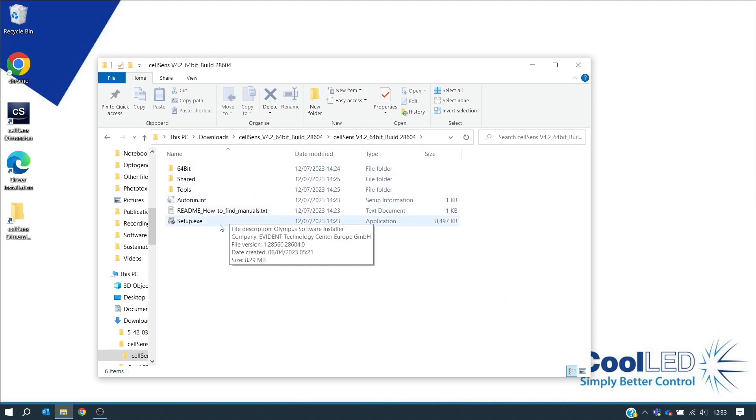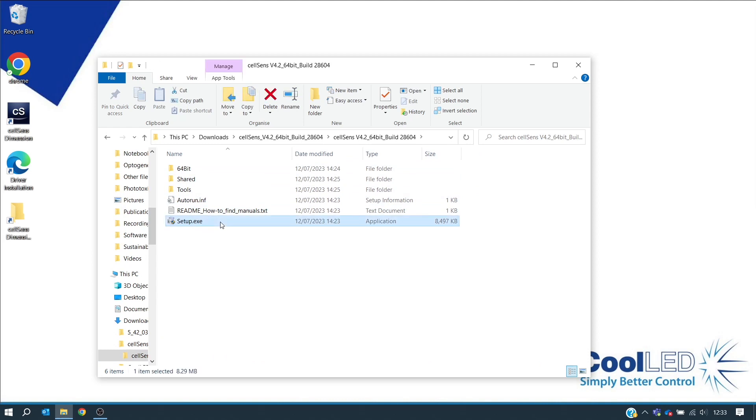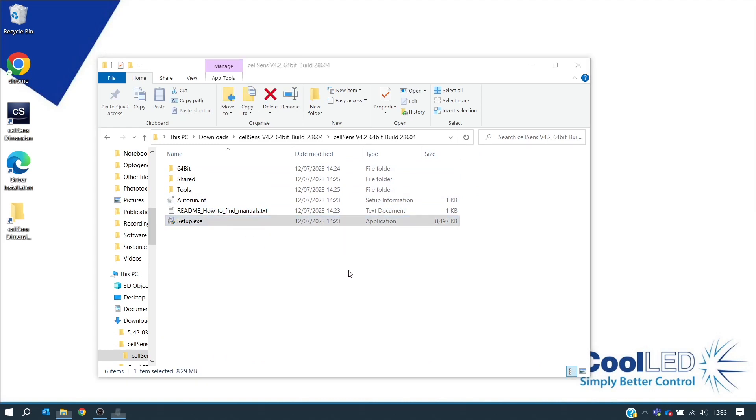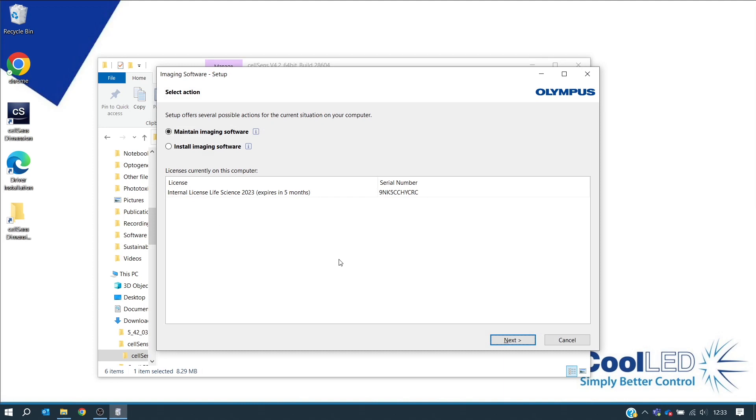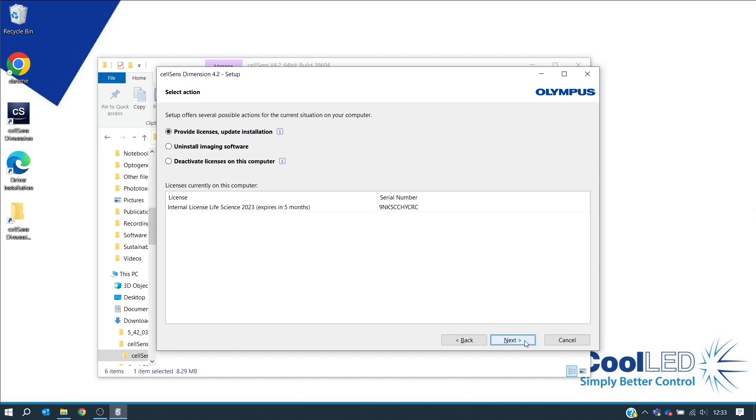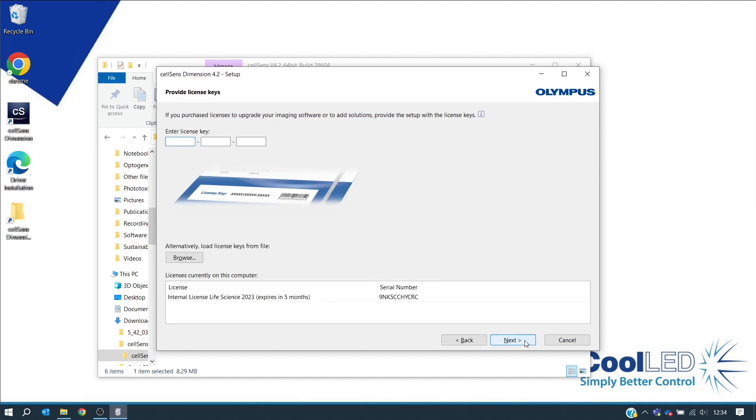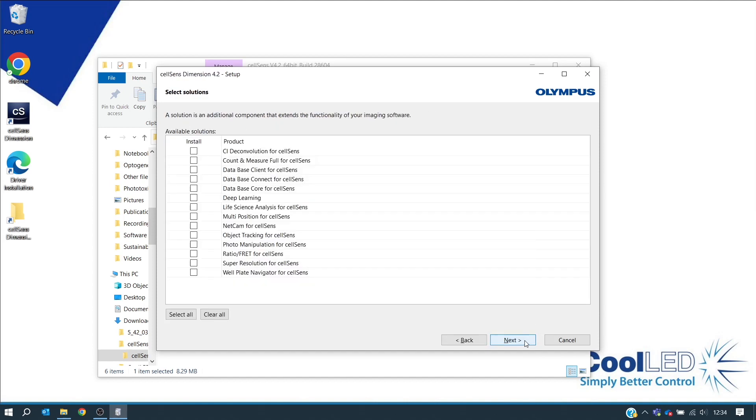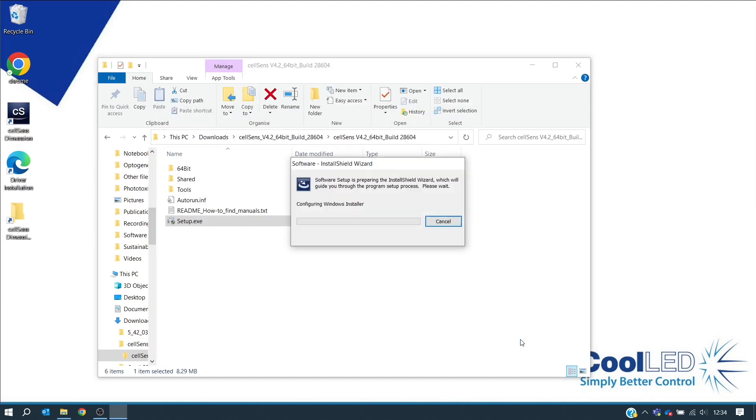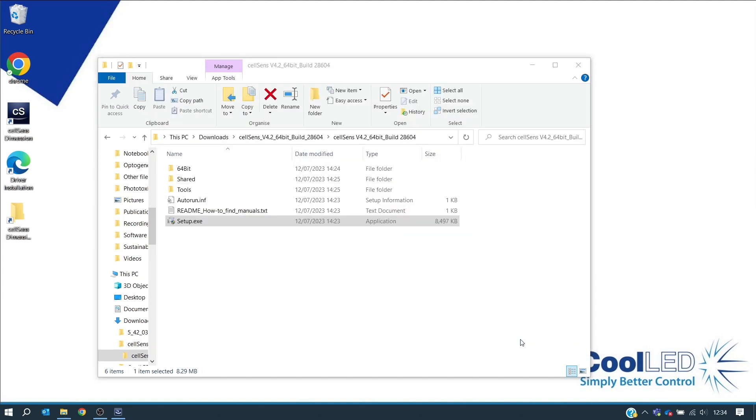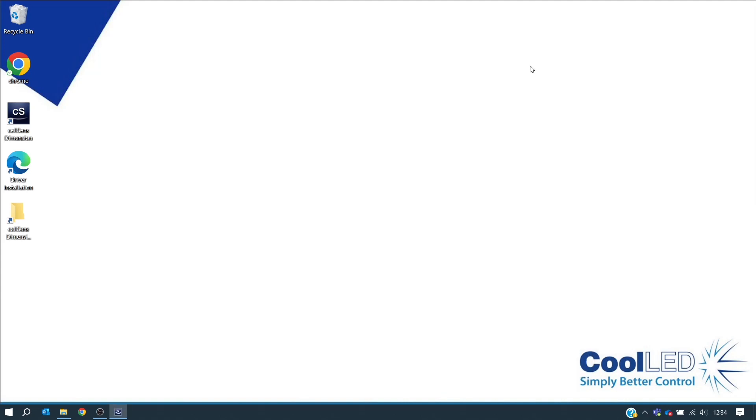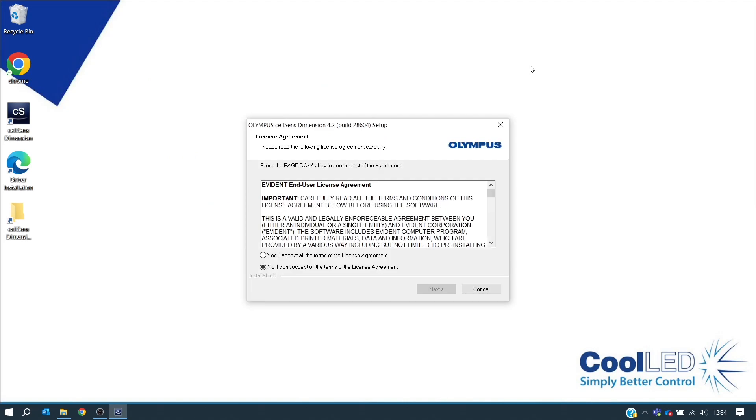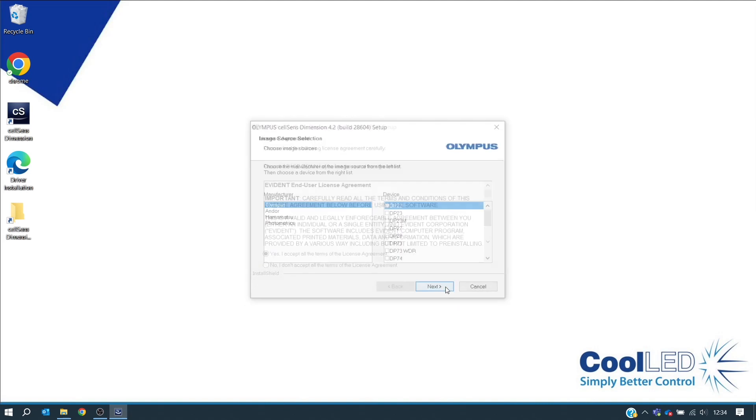Now select Setup. We want to maintain the imaging software because we don't want to reinstall it. Now click Next and follow the instructions. We already have our license key. Select Yes to accept all of the terms of the license agreement and click Next. Keep clicking Next.